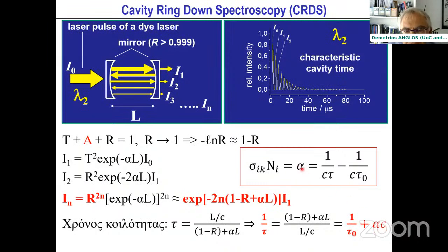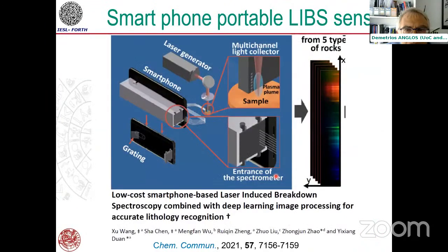The absorbance of the sample is basically the absorption cross-section times the number density of the gas. Thereby, by tuning the laser beam to a proper wavelength so that we have a healthy absorption cross-section, we have strong absorption, and we can achieve measurement of very low number densities or very low concentrations of gases by using this technique. Hence, the very low detection limits, on the order of a few ppb of moisture, in the slide that we saw previously. I think we're more or less finished.